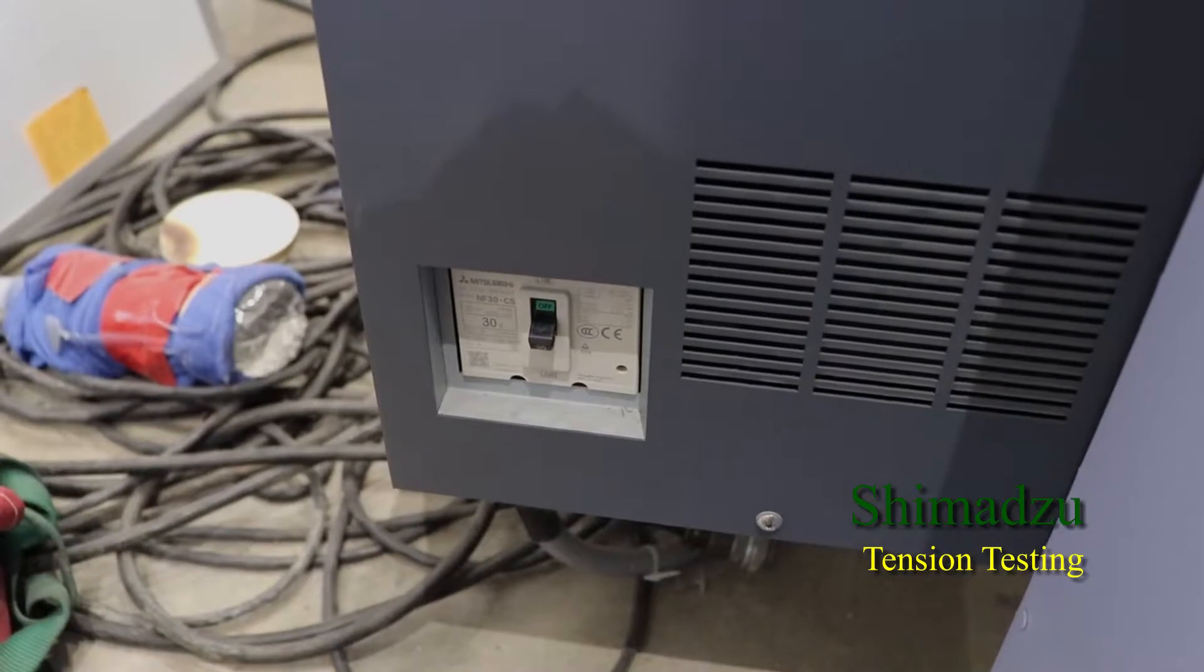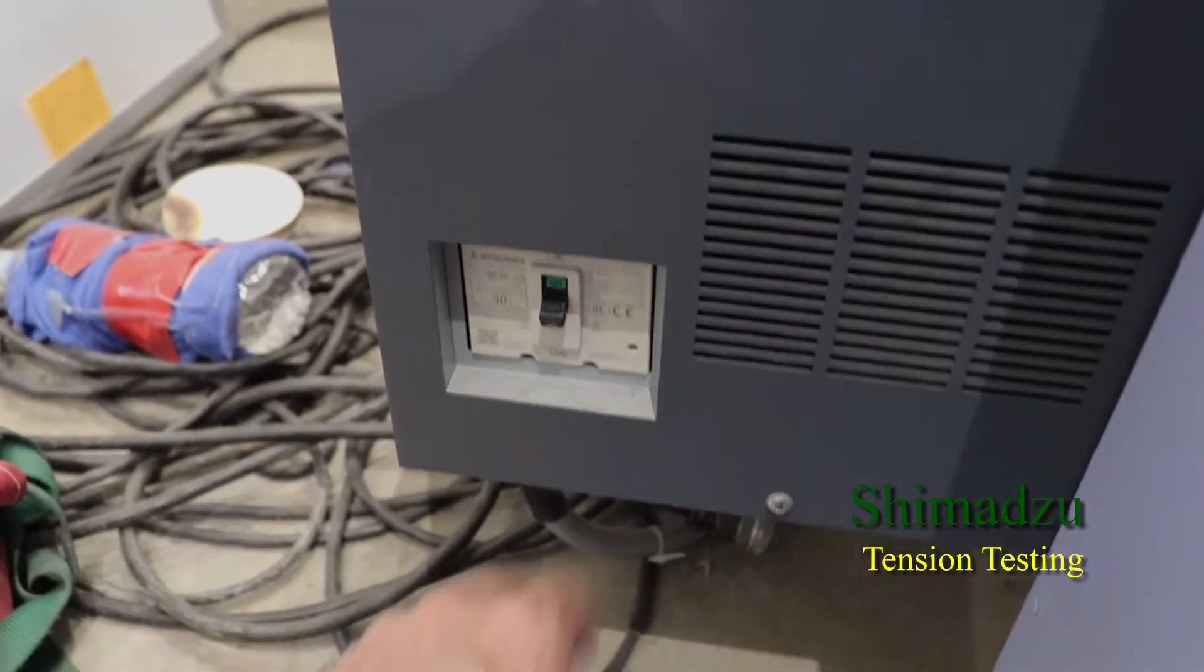Welcome to the tension test using the Shimadzu. First we need to power up the system.